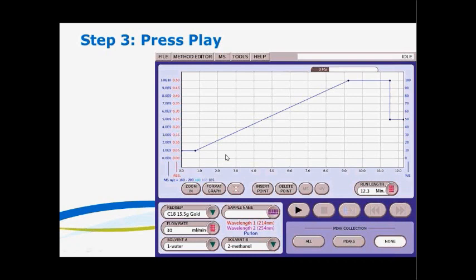What you see here is the gradient conditions. You also see right here listed the M/Z for the mass spec. You see the value of, in this example, 180 to 200 is blue, 180 is teal, 168 is a light blue, and 185 is a darker blue.